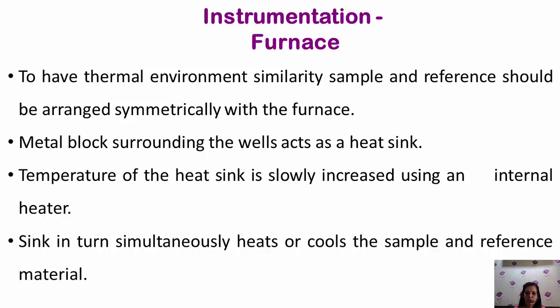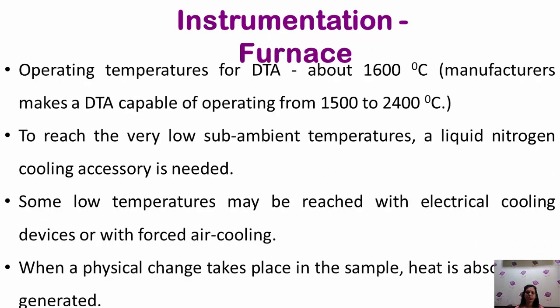Metal blocks surrounding the wells act as a heat sink for your sample and reference. The temperature of the heat sink is slowly increased using an internal heater, and the sink in turn simultaneously heats or cools the sample and reference material.